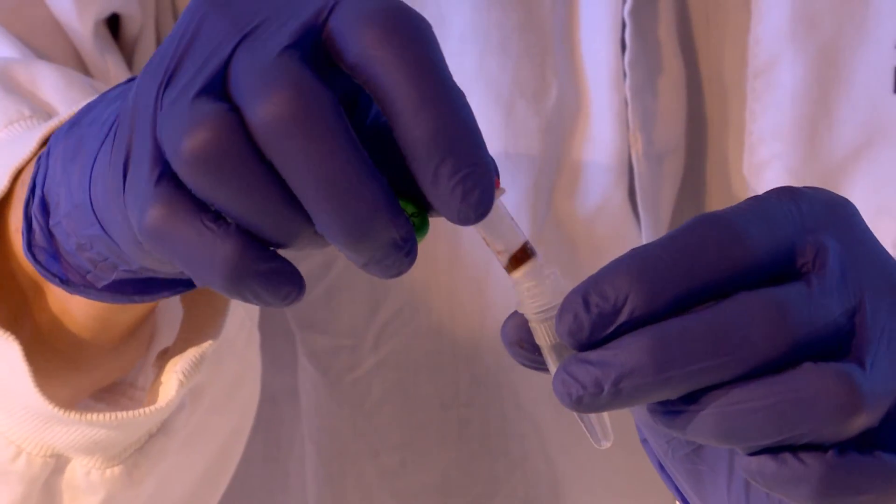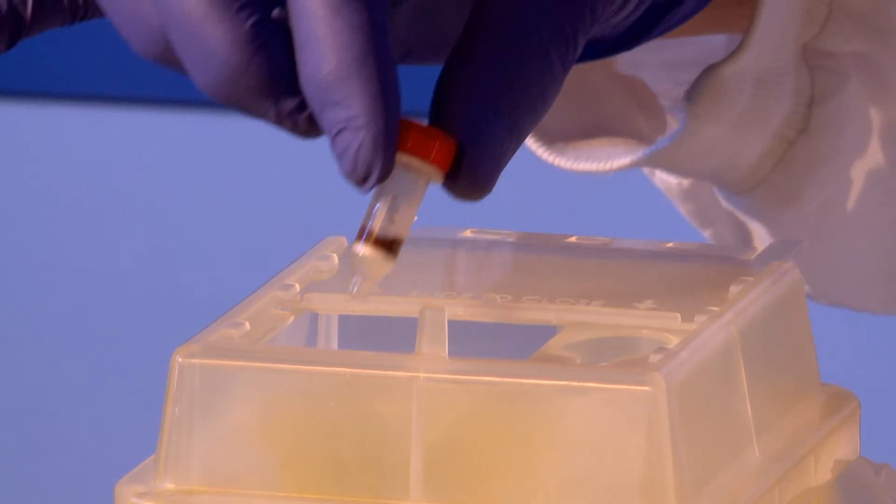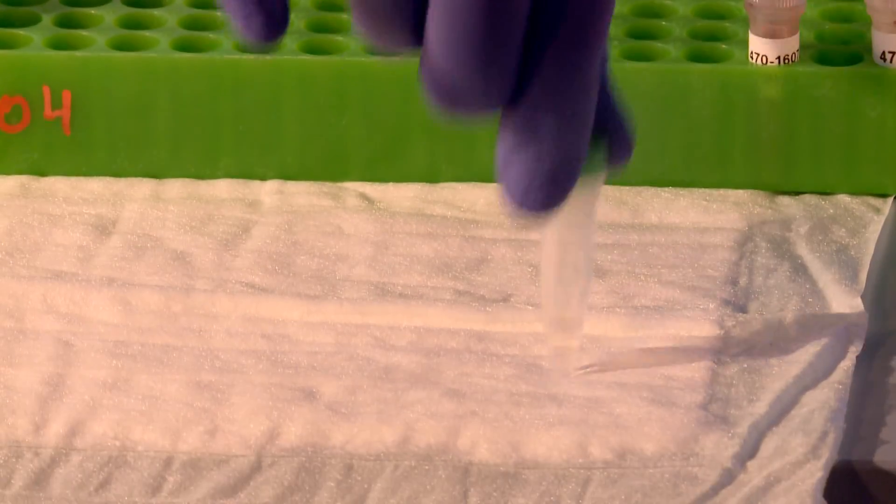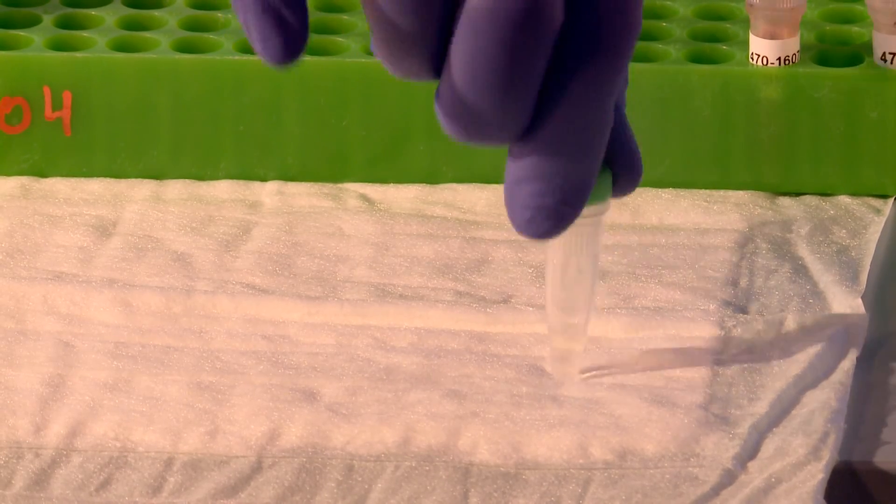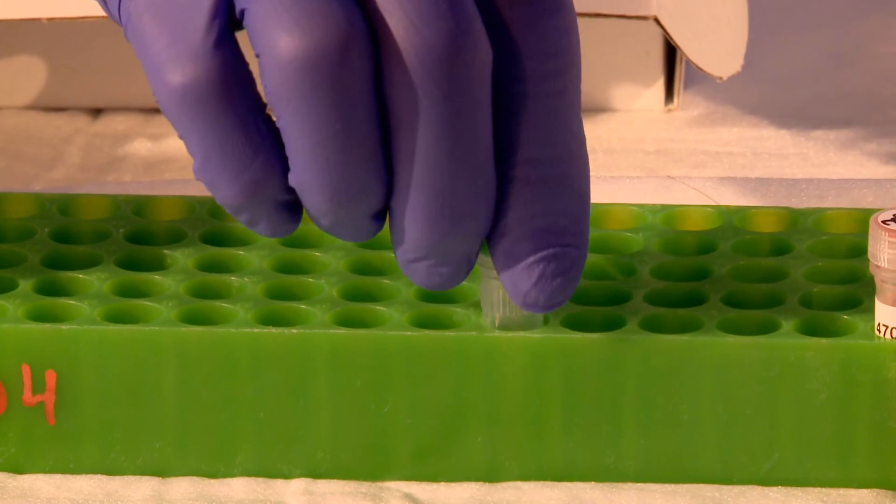Remove the collection vial from the column and close the tube with the green cap. Take care to discard the column into a biohazard container. Gently mix the contents of the collection vial now containing the extracted DNA. The extracted DNA is suitable for use in most PC-run reactions.